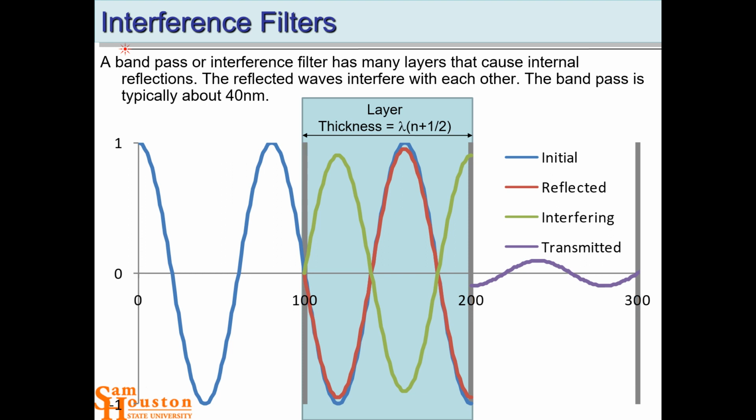Now, would you put this on the source? No, because you'd be killing your source. So you shine the source on the sample, you would put this interference filter on the detector so that the source light hits that detector on your camera or on your eyes, and none of the light gets through, or 1 out of 1,000 photons gets through.